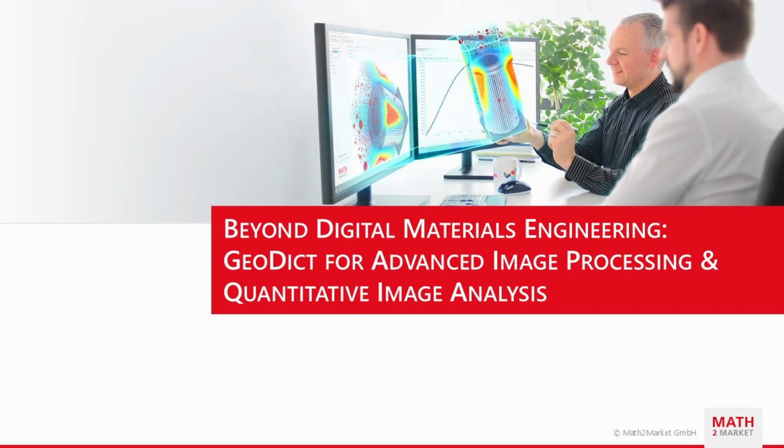GeoDict is widely known for simulation and digital materials engineering. What's less known is that GeoDict is also a powerful standalone platform for image processing and image analysis, which focuses on extracting reliable, quantitative insight directly from image data.